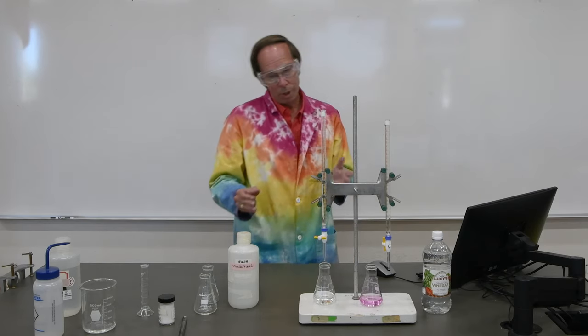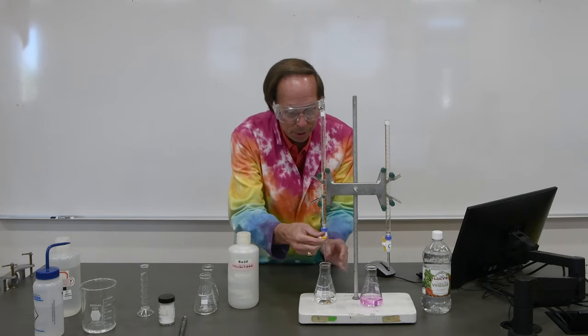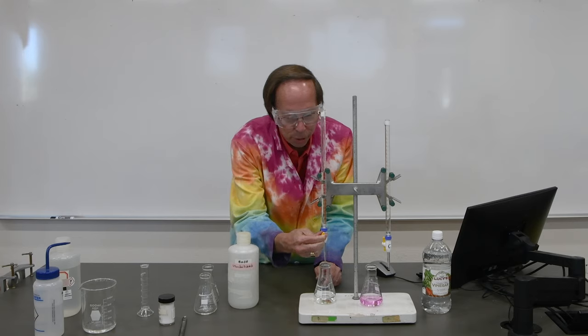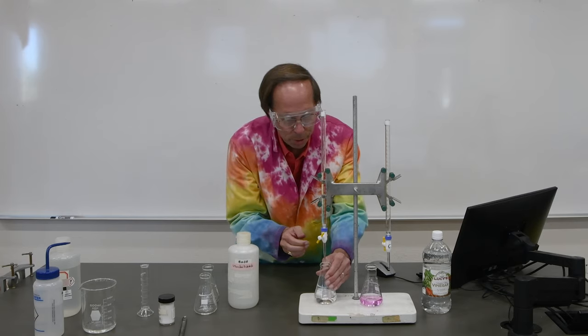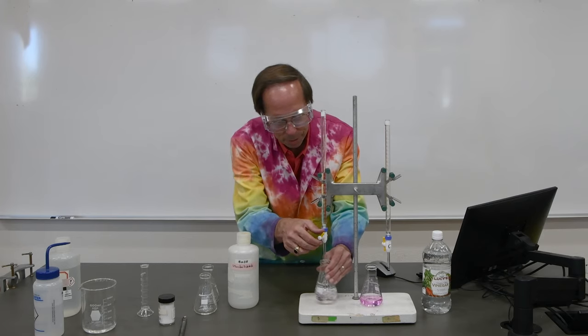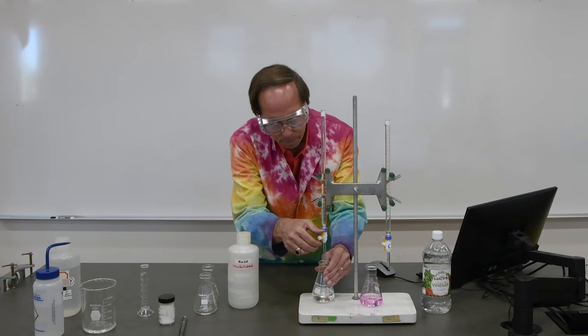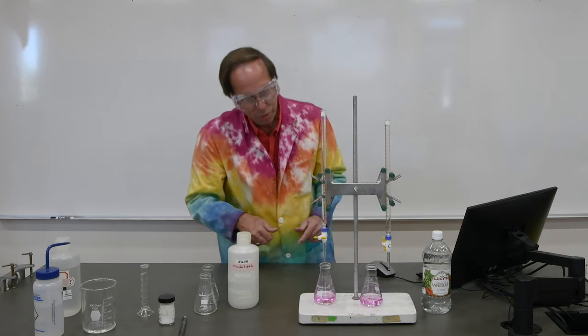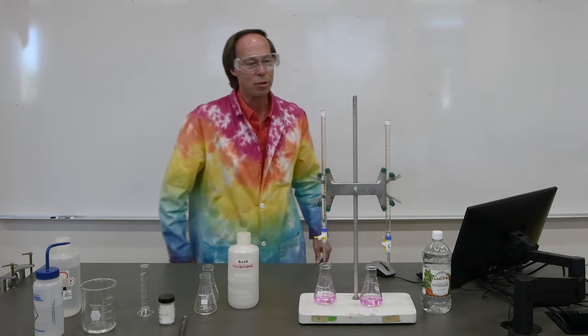All right. So we're about a milliliter away from where we expect it to change, so let's begin to add the phenolphthalein, or sorry, the sodium hydroxide very slowly. There we go. One drop at a time, drop and swirl. You can see the pink appearing momentarily. Looks like we're getting close. All right, I think that might have done it. That last drop looks like the pink is actually staying this time.